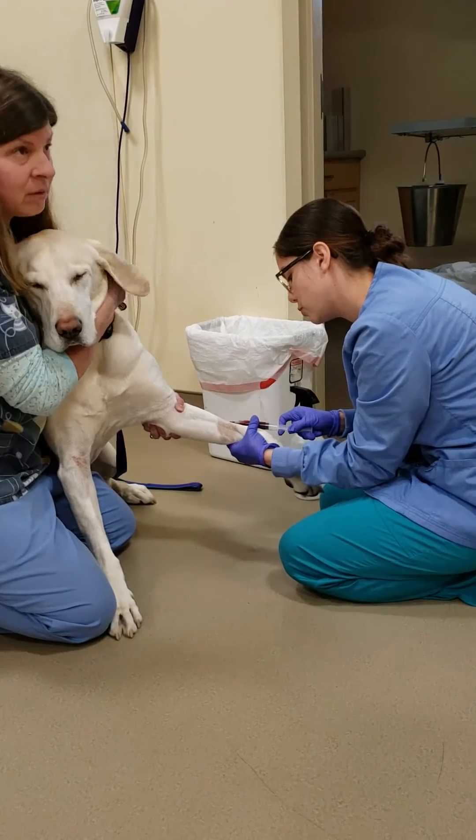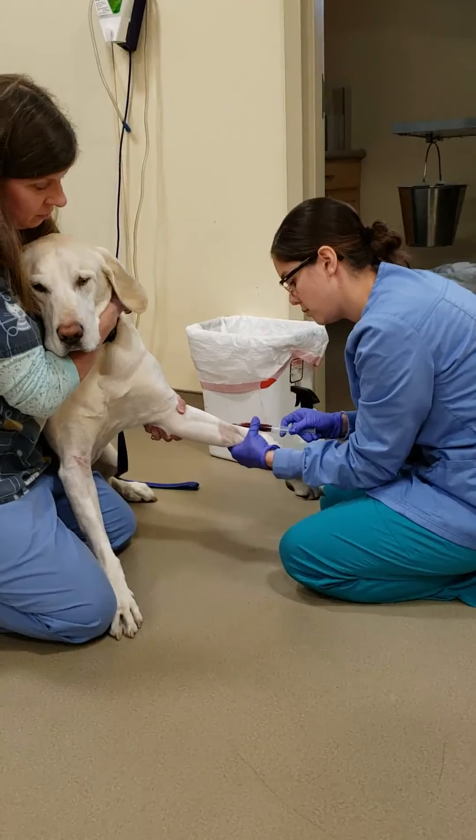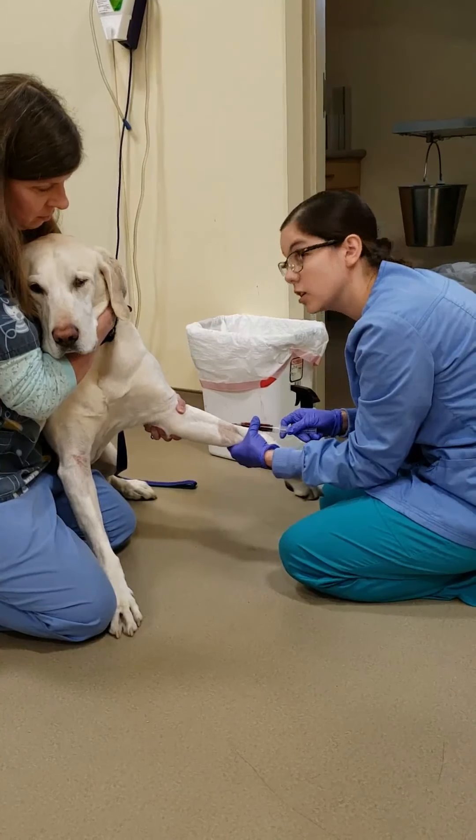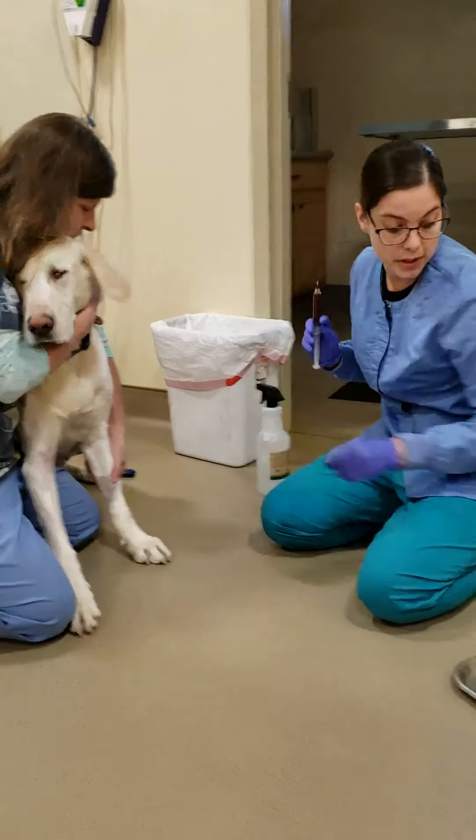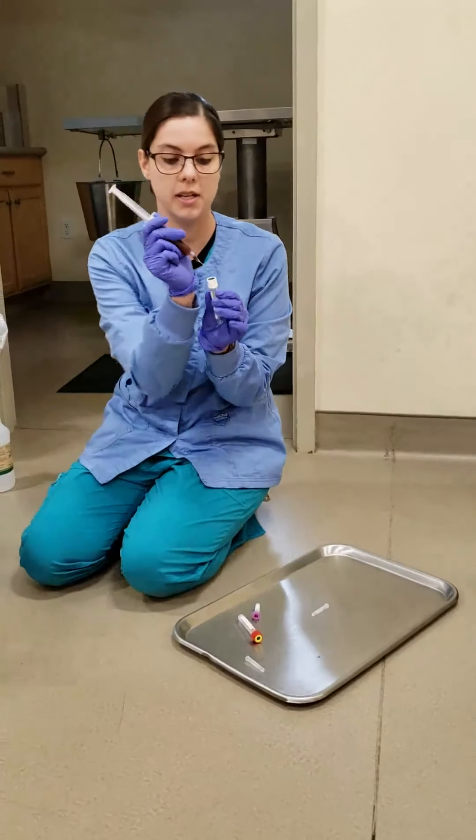You are such a good boy. Good boy. Good job, handsome. Alright. So now we would put our blood into our tubes.